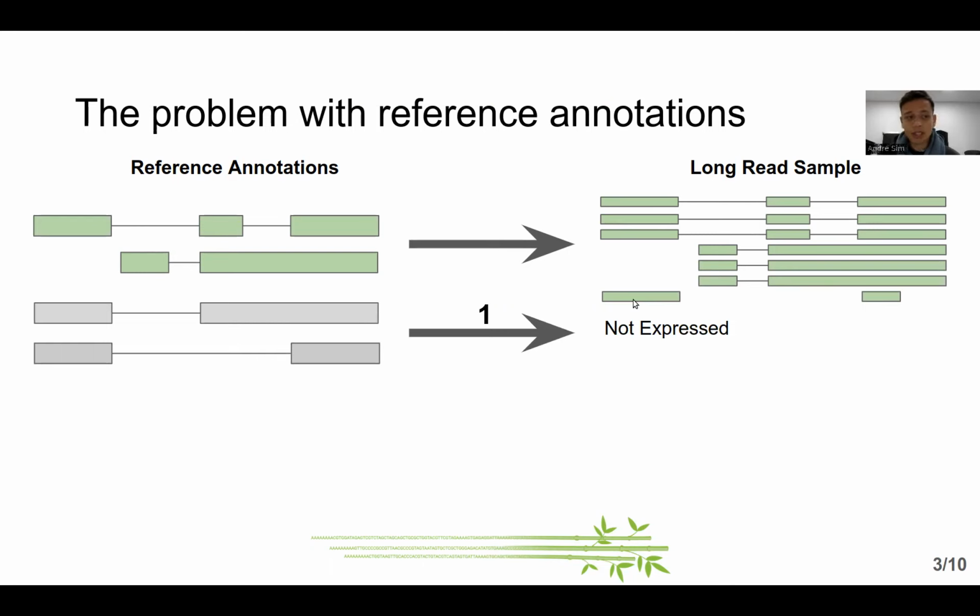Sometimes we'll get fragmented reads. So for example, we might get a fragment here, which we can uniquely assign to a particular isoform, which means quantification proceeds with no problems. But sometimes there are fragments that are a bit more ambiguous and could overlap with multiple reference annotations.